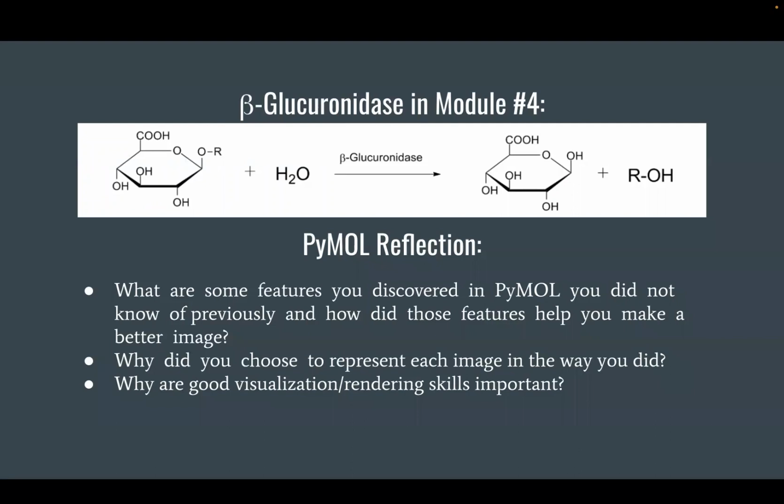We chose our pictures because they displayed the key features that showed major interactions which could lead to function or to cease a function, such as the interaction between inhibitor 8 and the bacterial loop, along with the active sites where it binds in the overall enzyme as a whole. It is important to provide good visualization and rendering skills because it provides clarification for research papers and allows scientists to easily locate and identify the key features for further analysis.